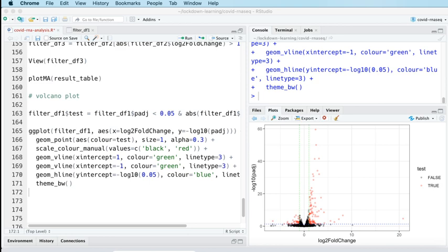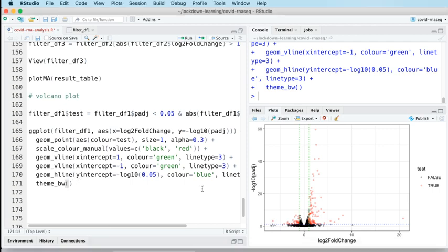Let me just... it's X limit. Is it xlim? Yes, xlim, I think.